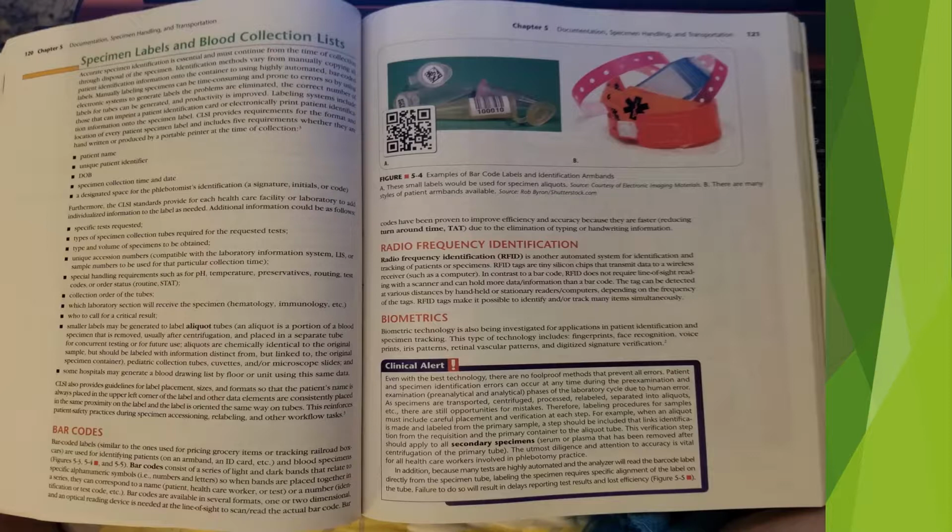Therefore, labeling procedures for samples must include careful placement and verification of each step. For example, when an aliquot is made and labeled from the primary sample, a step should be included that links identification from the requisition and the primary container to the aliquot tube. This verification step should apply to all secondary specimens, such as serum or plasma that has been removed after centrifugation of the primary tube.